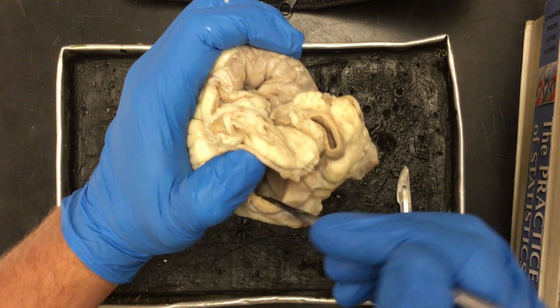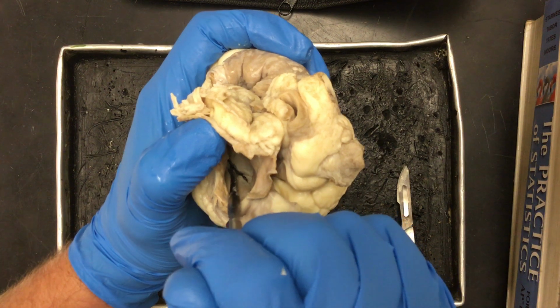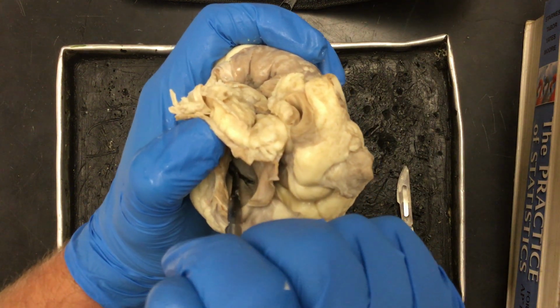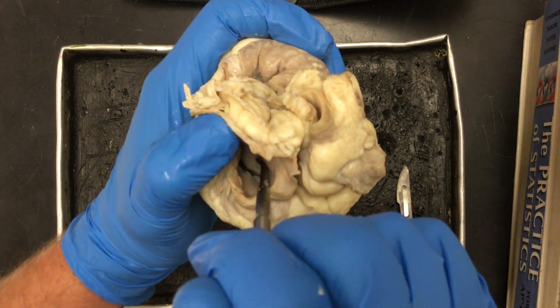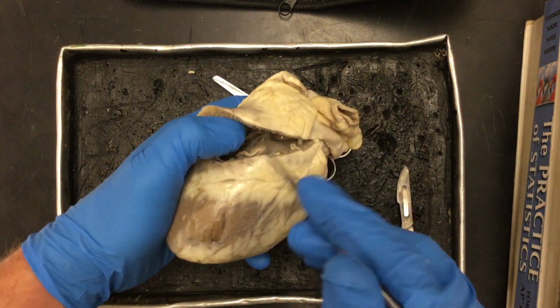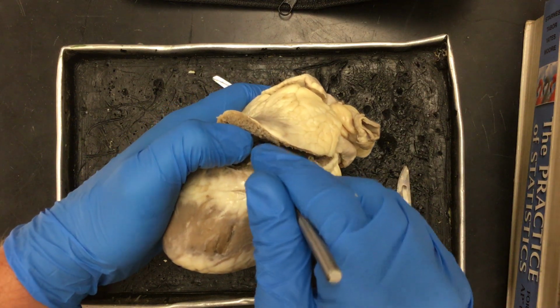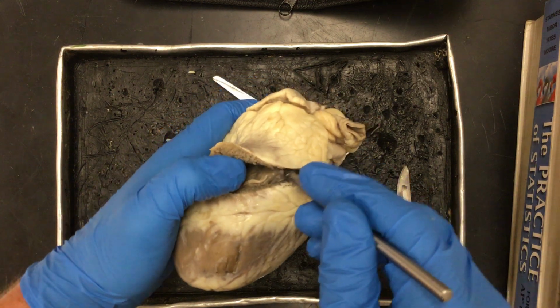This is where blood is stored from the superior and inferior vena cava. And straight down there is the right ventricle. And I have 1, 2, 3 flaps, my tricuspid valve. You'll notice I glide easily over the flaps this way. But if I try and approach from the right ventricle, I get caught in the flaps. The reason I get stopped there and can't go any further is because that's their job, to prevent backflow.